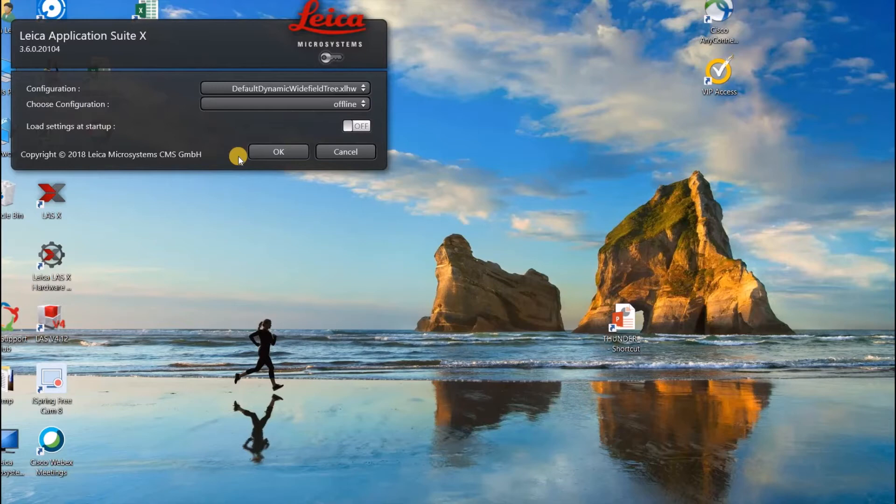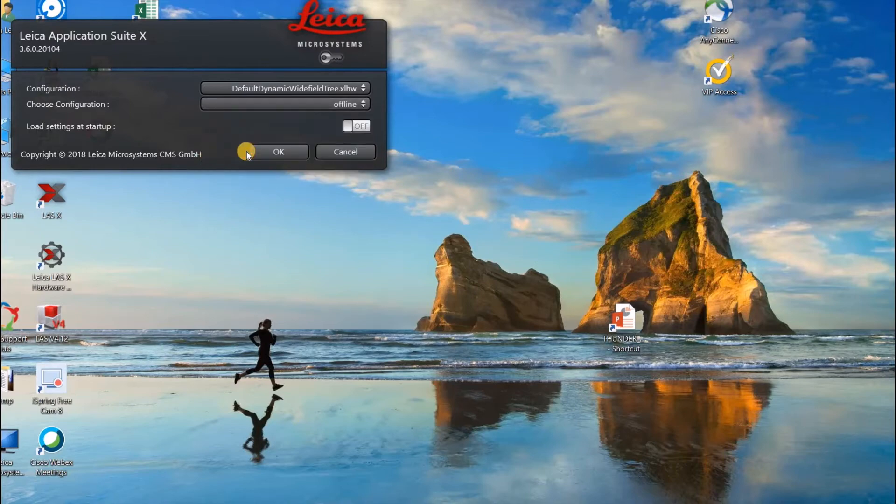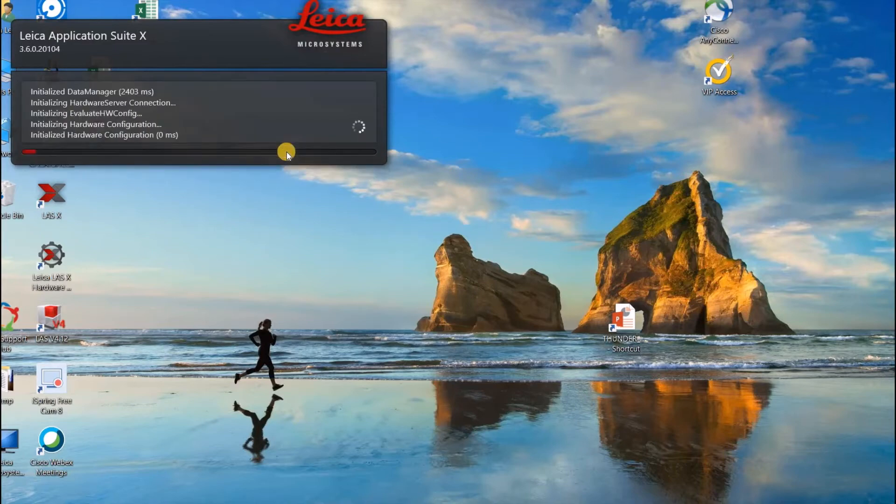And then when you get to this window here, you will be able to choose between your different configurations. And I will go ahead and choose my offline configuration and click OK.